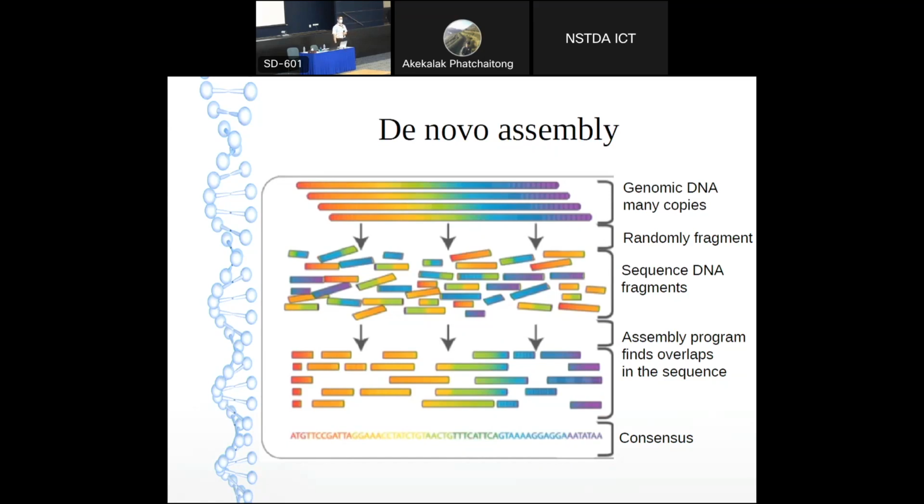The most common method to fragment a genome is by sonication. That's very high frequency sound waves that cause the water to vibrate, and the vibration then whips the fragment apart. And the average size of each fragment depends on the sequencing technology that we intend to use.